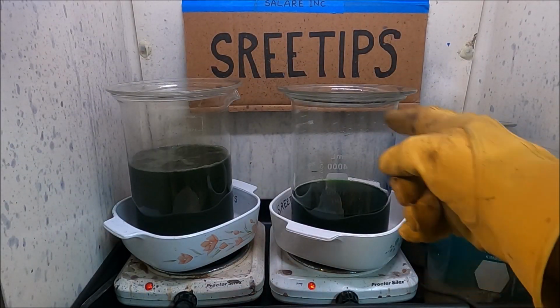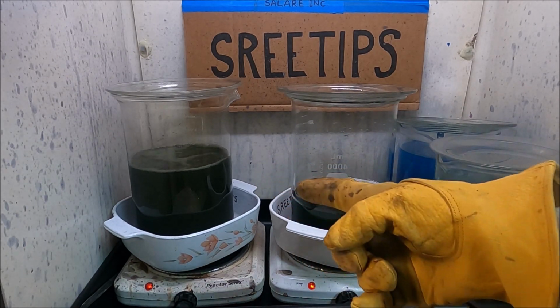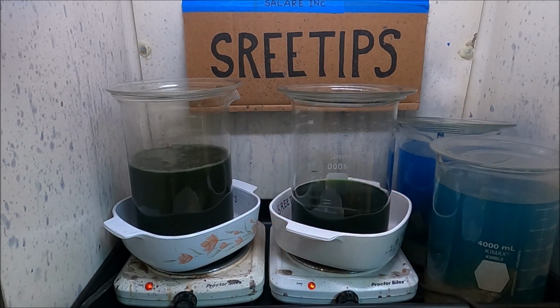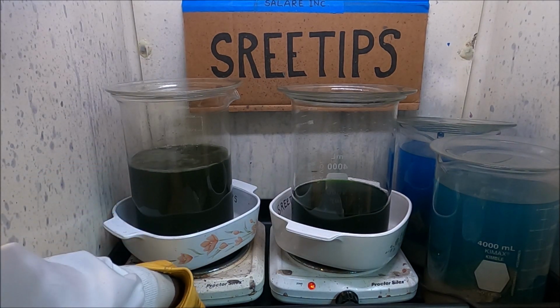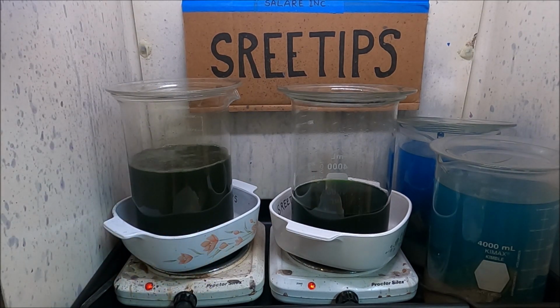I had to swap the beakers. This burner wouldn't get hot enough, so I put the beaker with the solids that was still reacting over here on this burner, cut it up on high. As you can see, we've got a rolling boil and no fume production. So I'm going to turn the heat off now, and we're going to let this settle. This will be the last clip for part 2. This will conclude part 2 of the series.